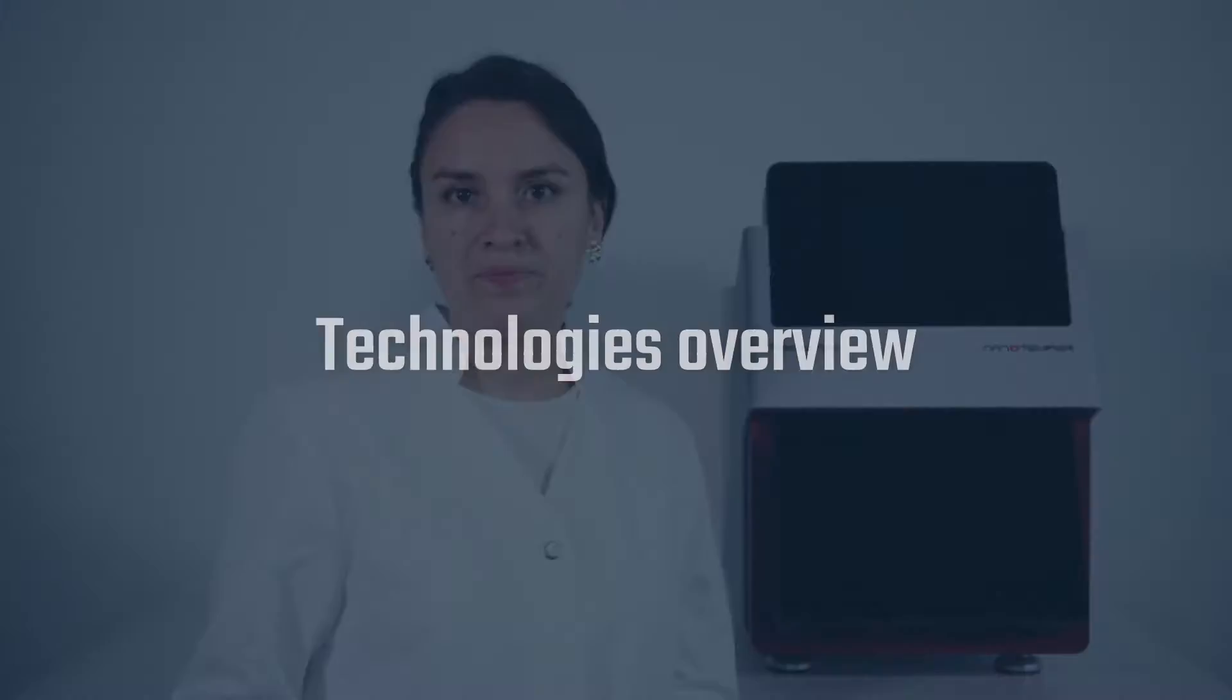Hi everyone, join me for a quick exploration of Prometheus Panta. I will start with a short review of the four technologies supported by the instrument, and then I will walk you through how to operate the Prometheus Panta and the first steps to start an experiment with the Panta control software.